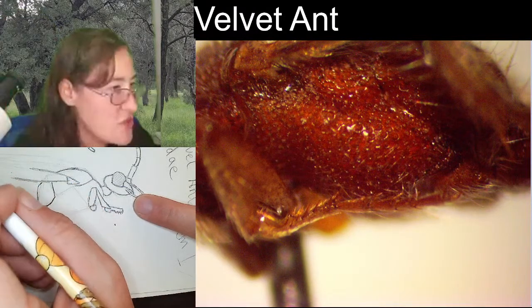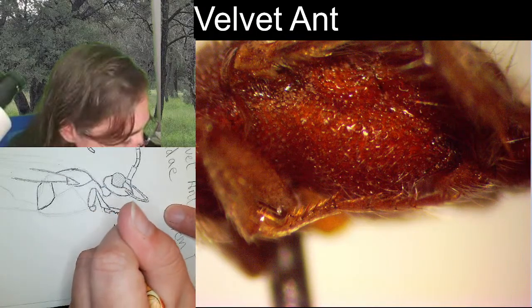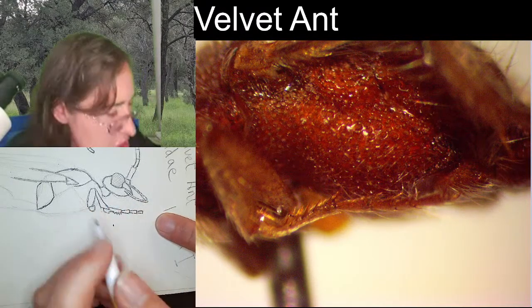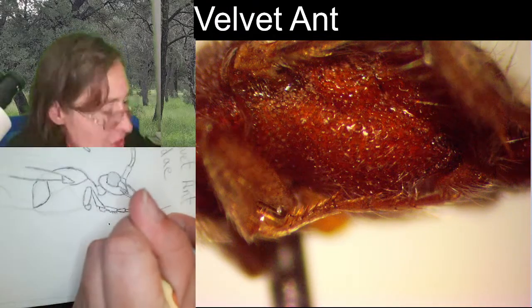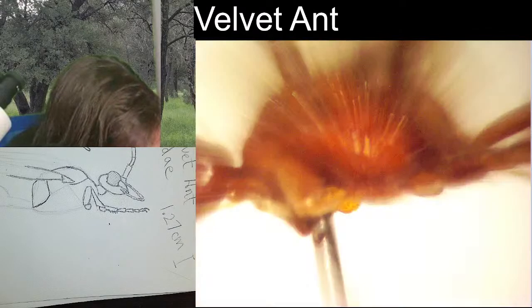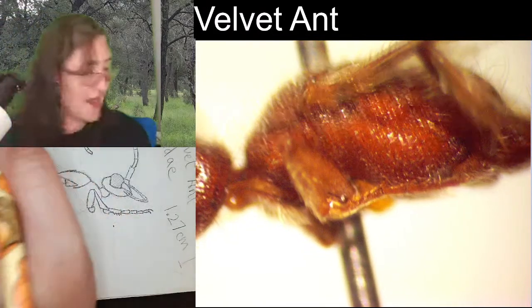So if we draw those, they look a little bit like this. We have one triangular shape, two triangular shape, three, and these ones do get smaller and smaller as they go on. So four, and then the fifth one is this kind of raindrop shaped segment with the two claws. And I would say that this is a fair length for the leg in general.